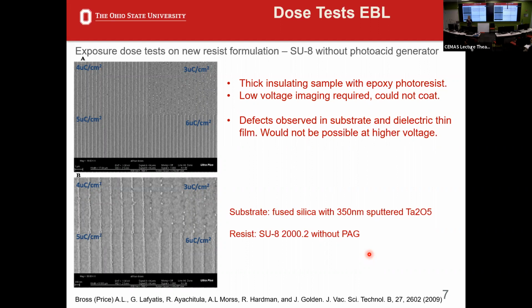But yes, absolutely. Some of the other electron beam resists that we use, polymethyl methacrylate, plexiglass, just acrylic, is very soft. So you hit it with an electron beam, you've exposed it, now you are definitely damaging it. In that case, you want to image an area that you don't want to use, or a sacrificial sample. Yeah, really good question.